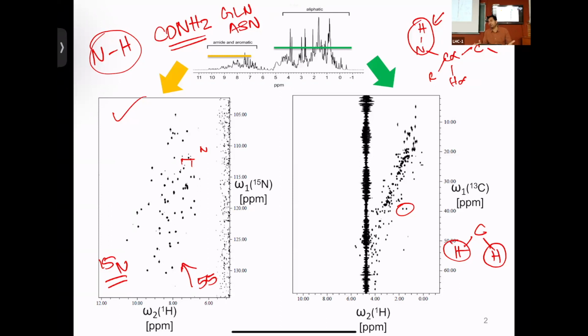They run the HSQC to see if the protein is already reported. If not, they will anyway have to run the nitrogen HSQC to see how the spectrum looks. There are a few important aspects that we can learn from this HSQC spectrum. You see the proton spans a good chemical shift range. It ranges from close to 6 ppm to maybe around 11 ppm.